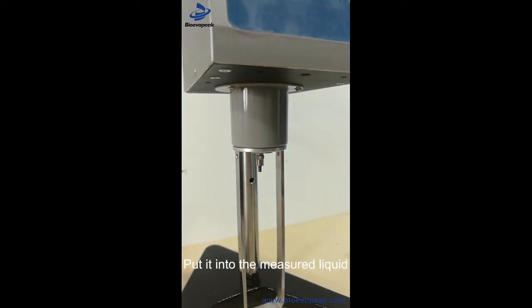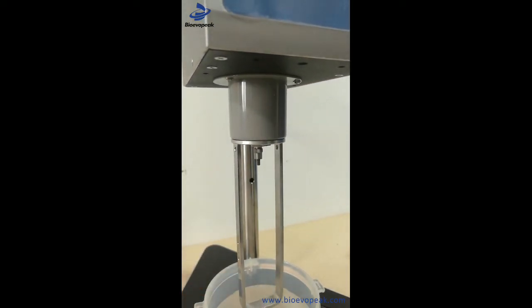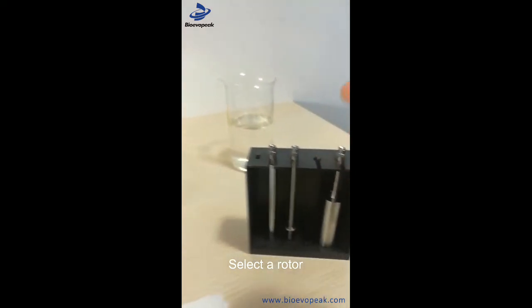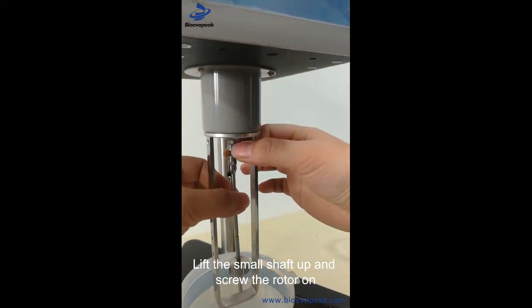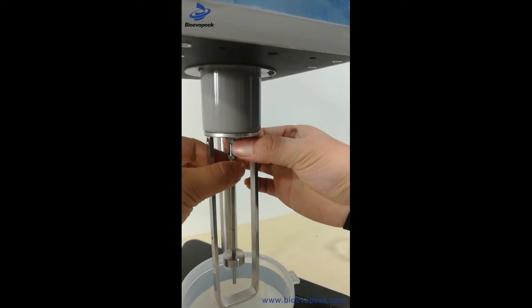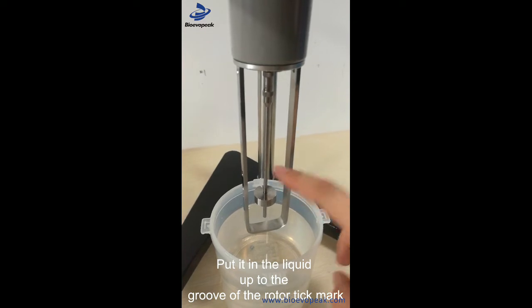Install the cleaned frame and fasten it. Place the liquid into the container. Select a rotor and submerge it into the liquid up to the rotor graduation line at the groove.